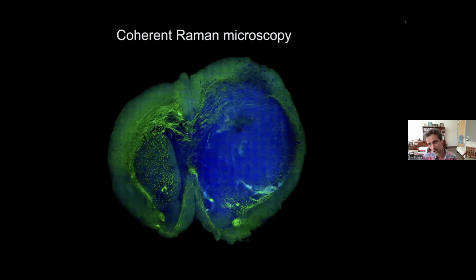So this is just to illustrate that. This is a picture, I didn't take it myself, one of my colleagues took it. Beautiful picture of a mouse brain. There's a huge tumor there, as you can see, okay?